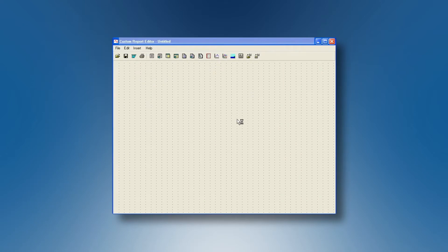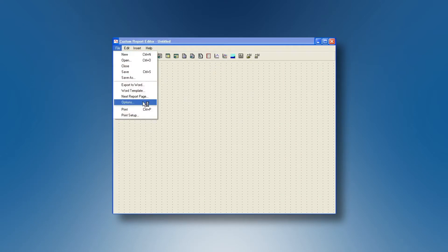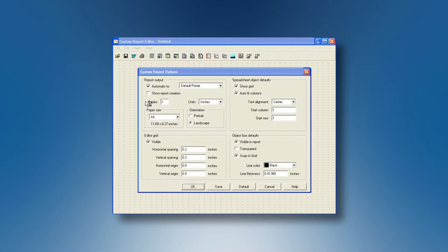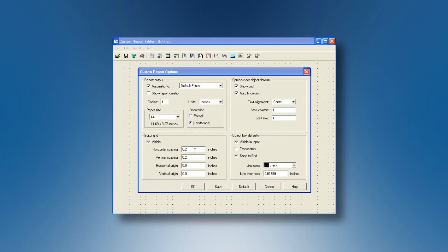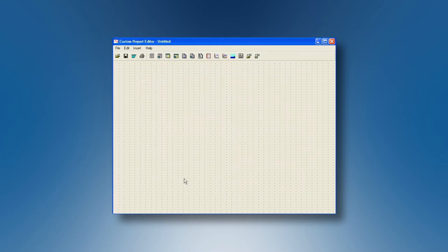This is our blank page. We can go to file, options, we can decide for the paper size for instance A4, for the orientation, portrait or landscape. We can save this if necessary.